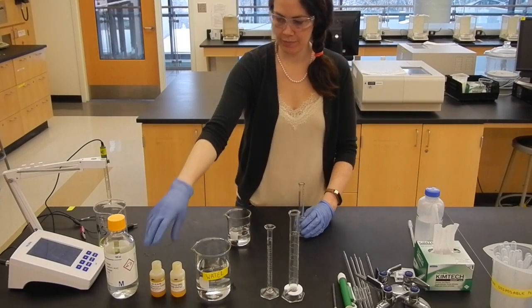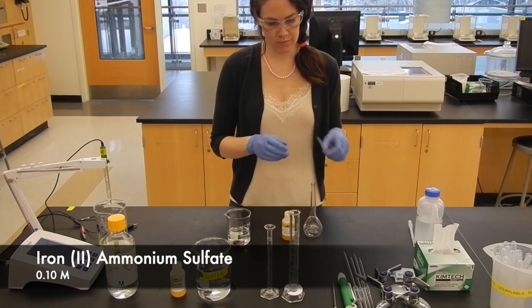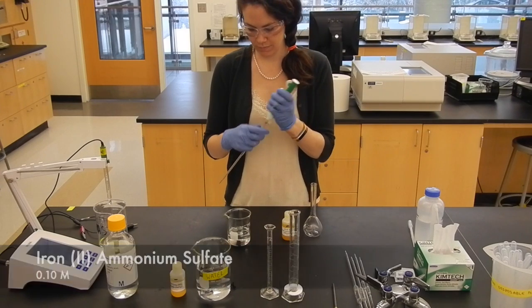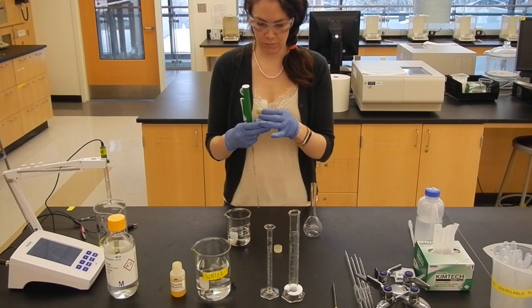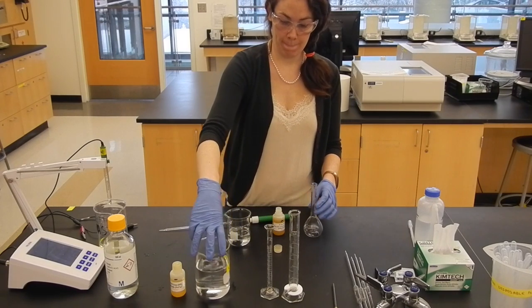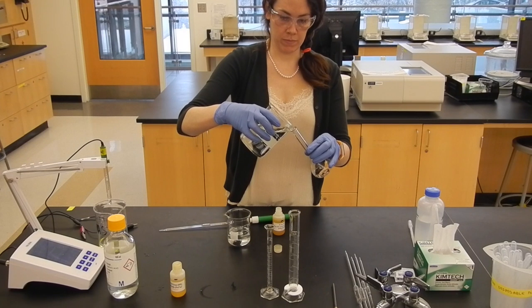Next, we need to make a dilute solution of the iron 2 compound. This will be used to vary the relative concentrations of the iron 2 and iron 3 compounds in the reaction beaker. Having cleaned the glassware, the same volumetric flask will be used to make this solution as was used for the first.